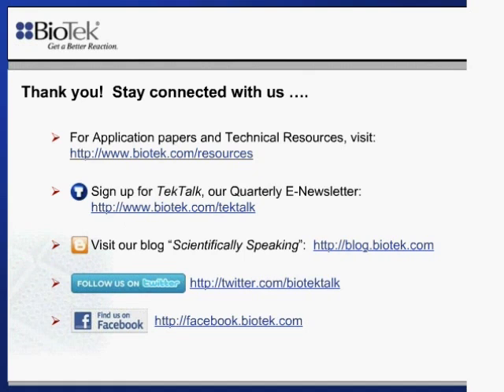Next question, is there a method to fluorescently quantitate glucose using a microvolume assay feature? That's an excellent question. We haven't tried that here yet. We do have an app note on fluorescent quantitation of glucose, but we haven't tried it in a microvolume, so that might be worth looking at in the future as well. Thank you for that question.